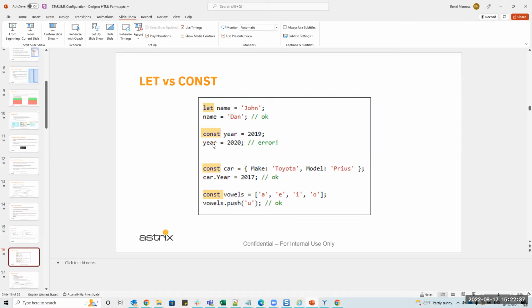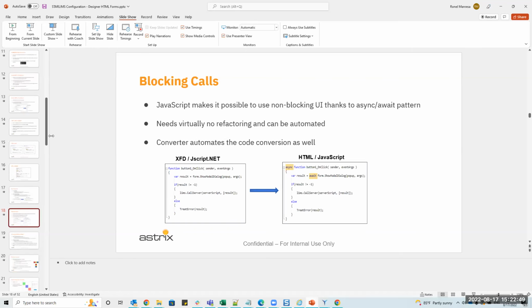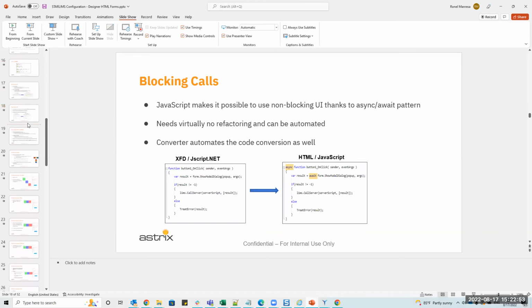Okay, so good, right? These are more advanced examples with objects and stuff, but the idea is the same. Okay, this is going to get more interesting. Oh yeah, I'm so behind. Oh boy. All right, let's see how much we can get done. So blocking calls.